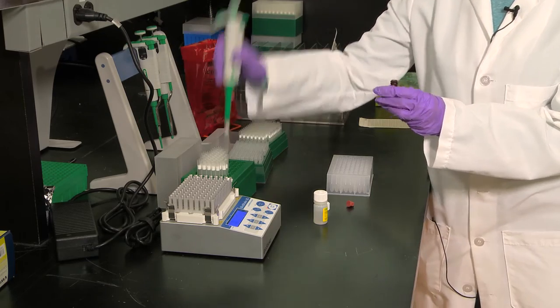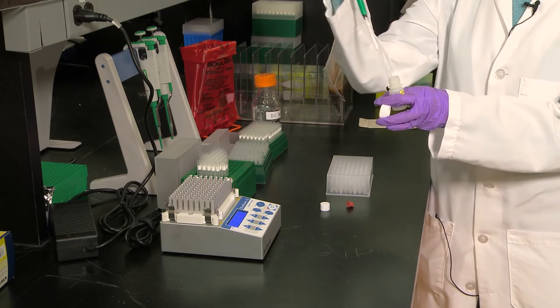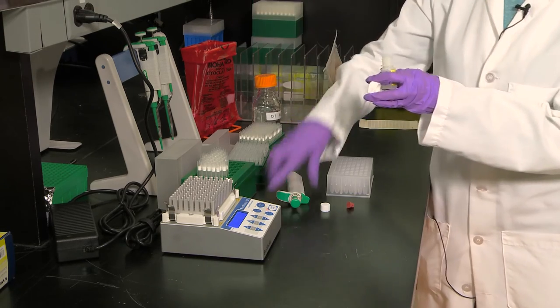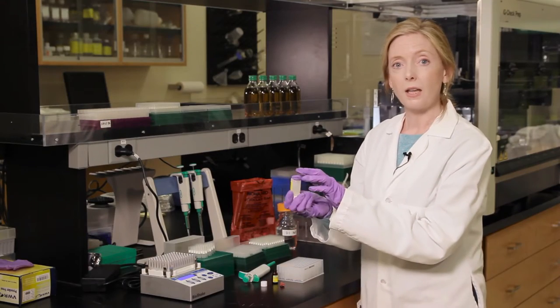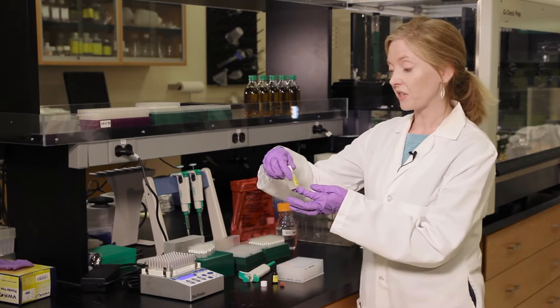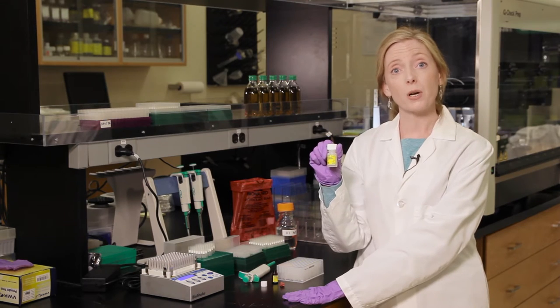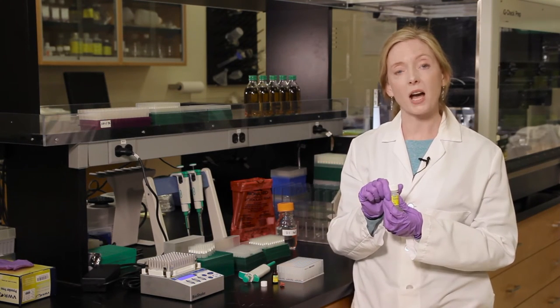Now transfer the contents of G1 into the G2 bottle, which is the activation solution, using a pipette to transfer the solution across. Gently invert to mix again. Now it's activated and ready for use. You can store this at the bench for 24 hours, in the fridge for a week, or for three months at minus 20 degrees.